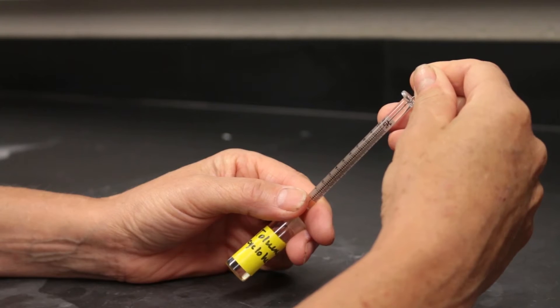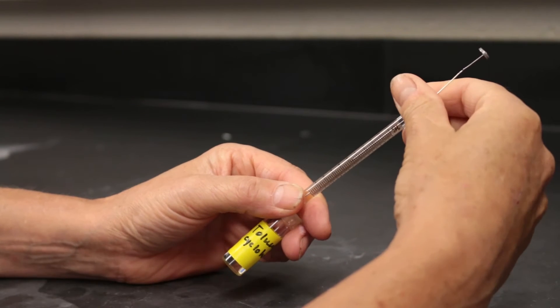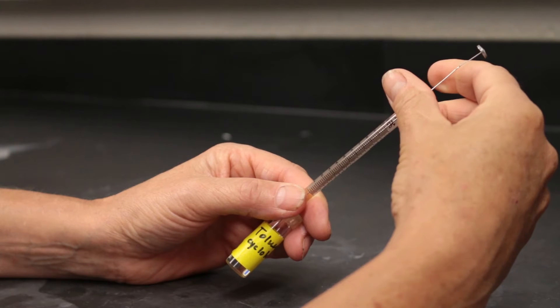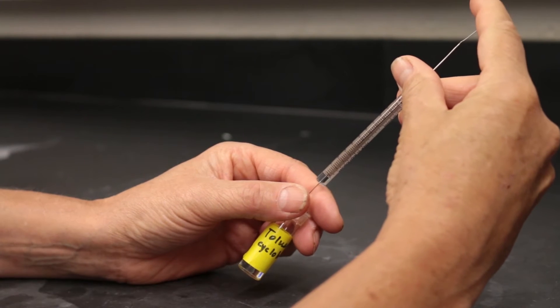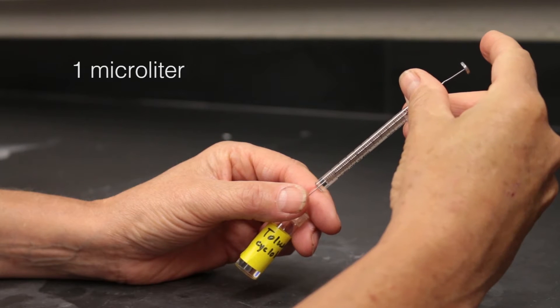Once again, submerge the needle in the solution and pull up the plunger so that the sample is about halfway up the barrel of the syringe. Carefully depress the plunger until it reaches the one microliter mark on the syringe.